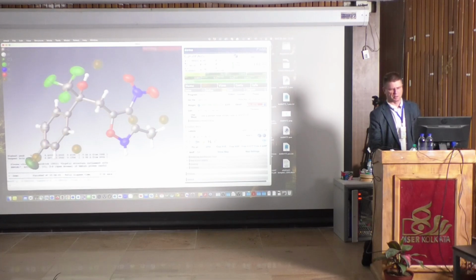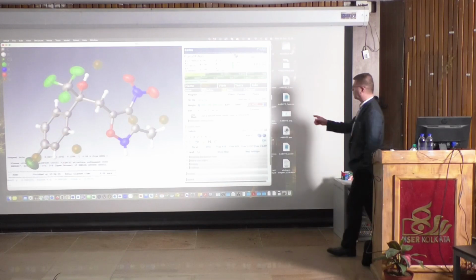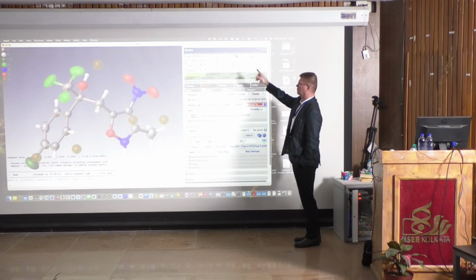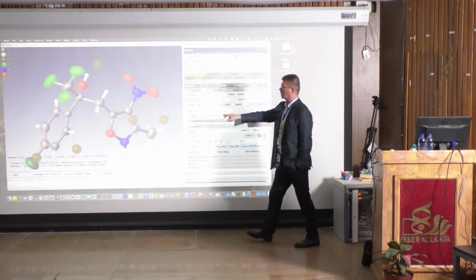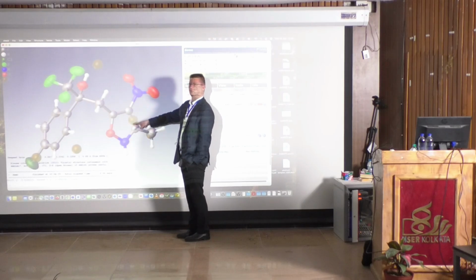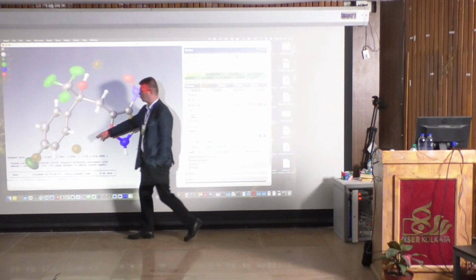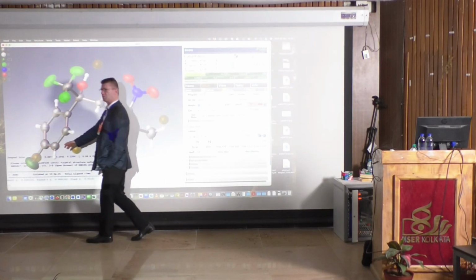Repeat it, we are there. Look now, all the numbers, except this one, are green. We have all the atoms, and these things here are backgrounds. You can see that there cannot be anything here between these two atoms, but it's a background. This is a typical thing of us having these peaks.